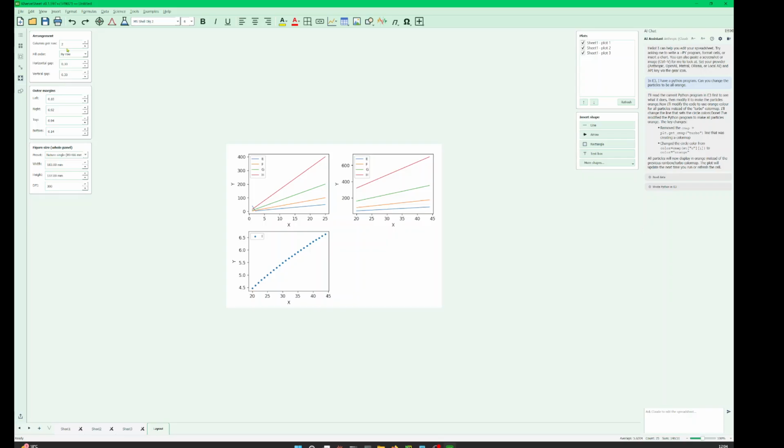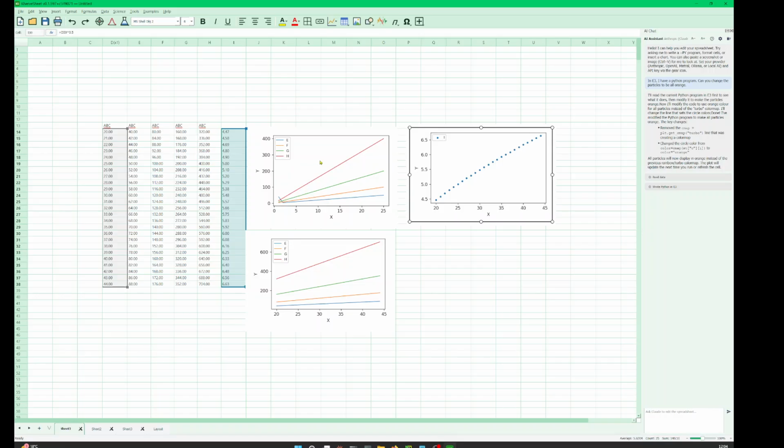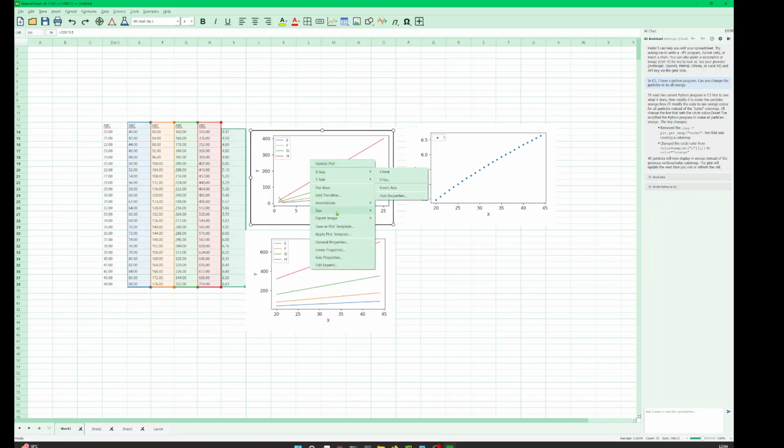You can change the size, so the figure size is shown here from different papers. And if you want to add some arrow, you can just go in here, do something, do as you wish. You can also add annotation inside the plot.